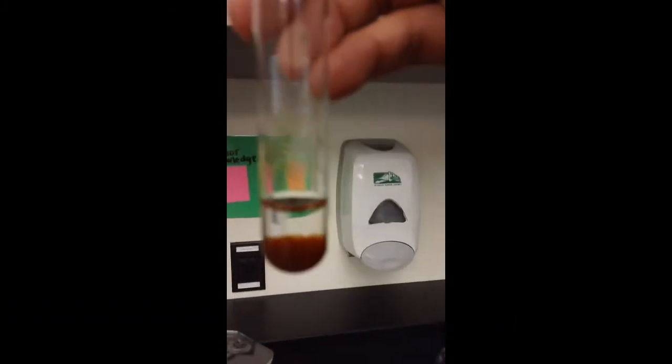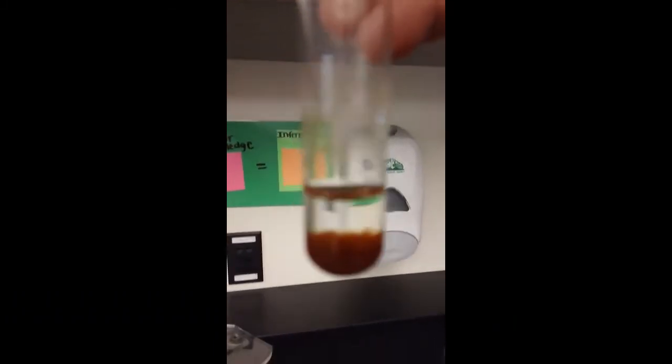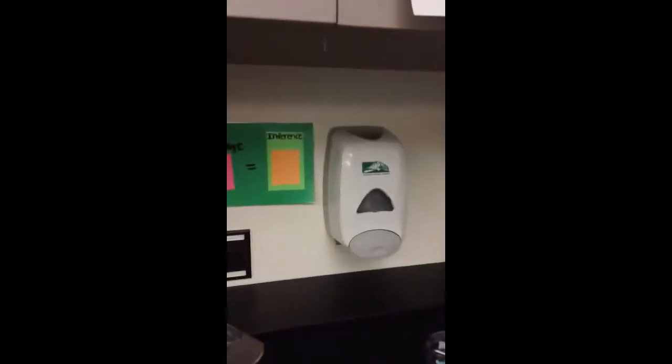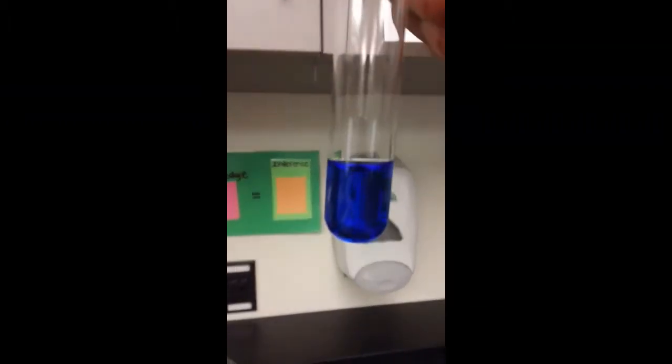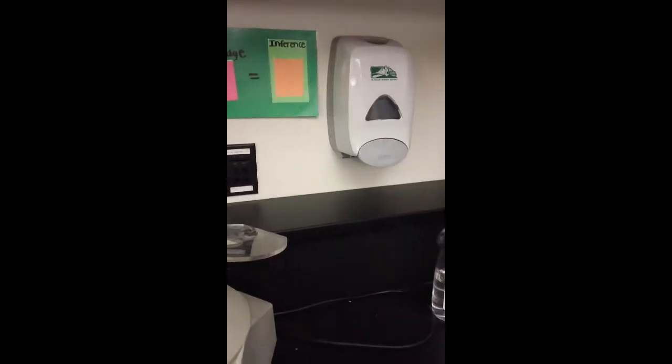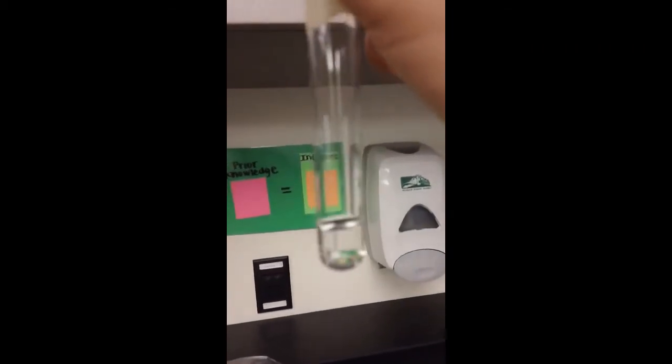Okay. Then we have our Fe. Notice we have a solid there. Our zinc does not look like we have a solid. We have our Cu. Okay. And here we have our potassium nitrate. Okay. So now what we're going to be doing is centrifuging.